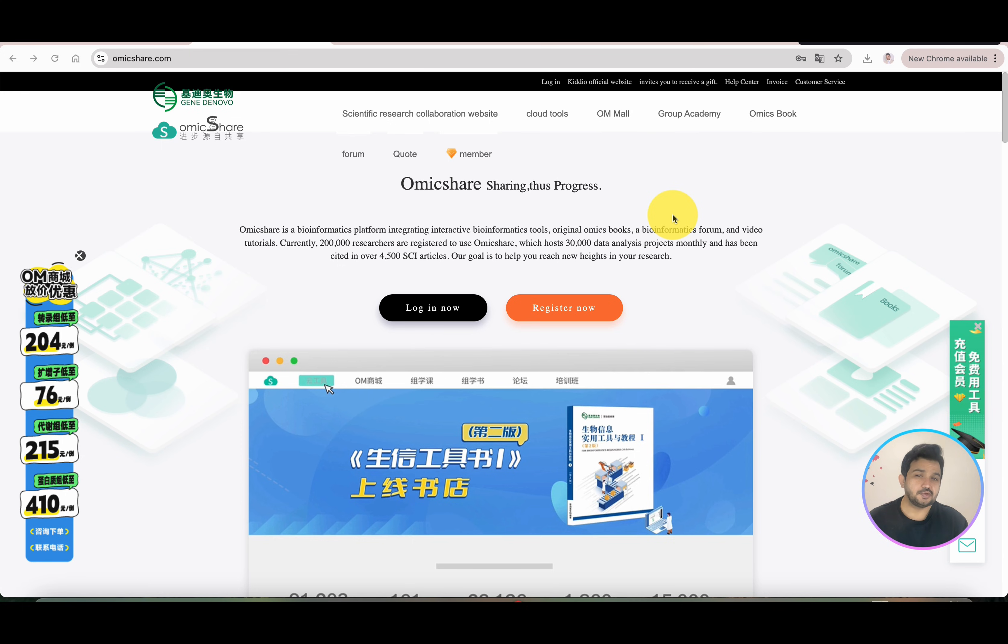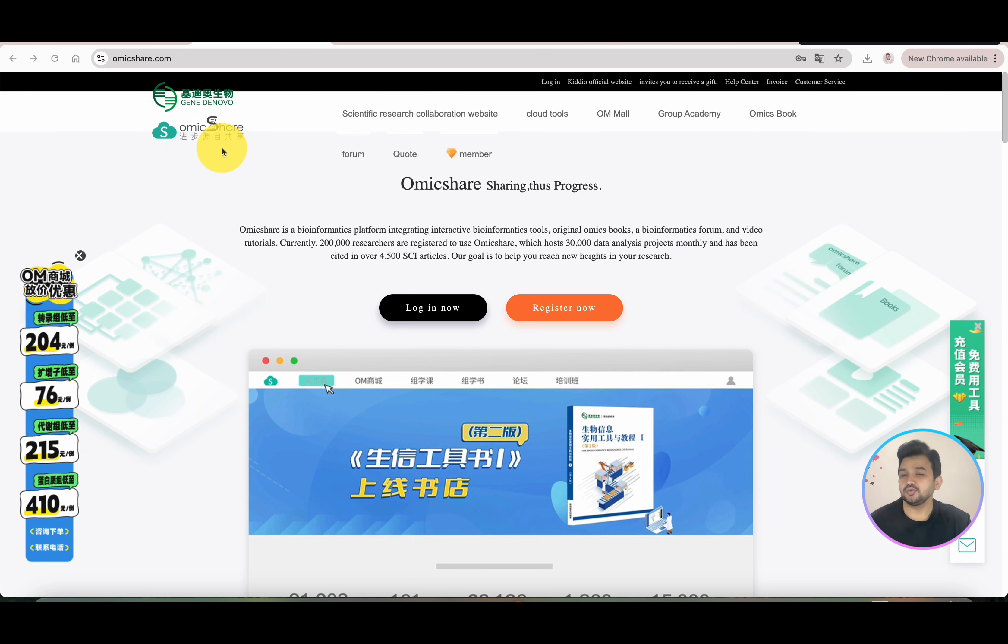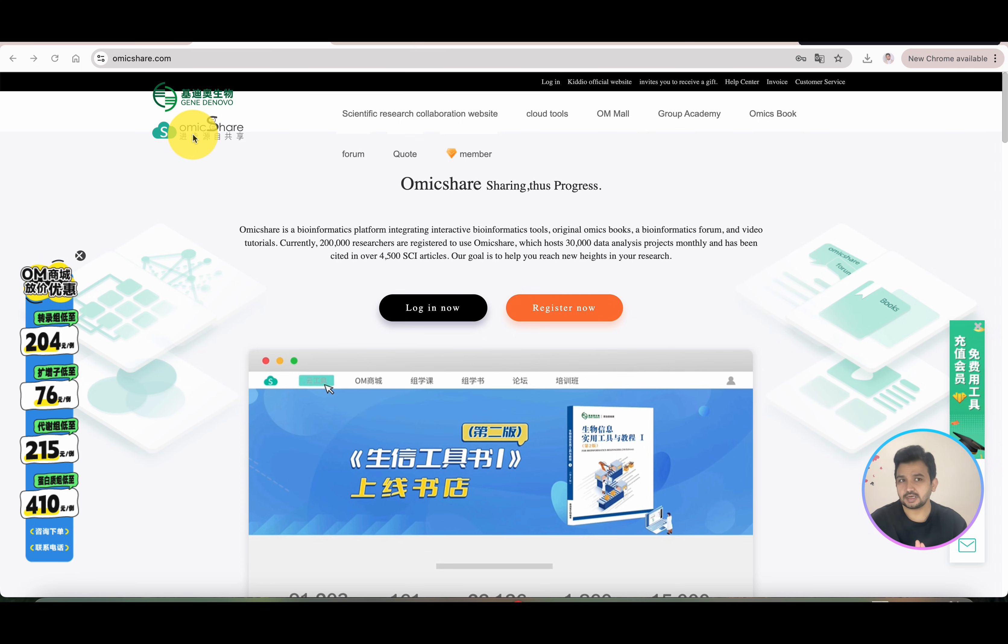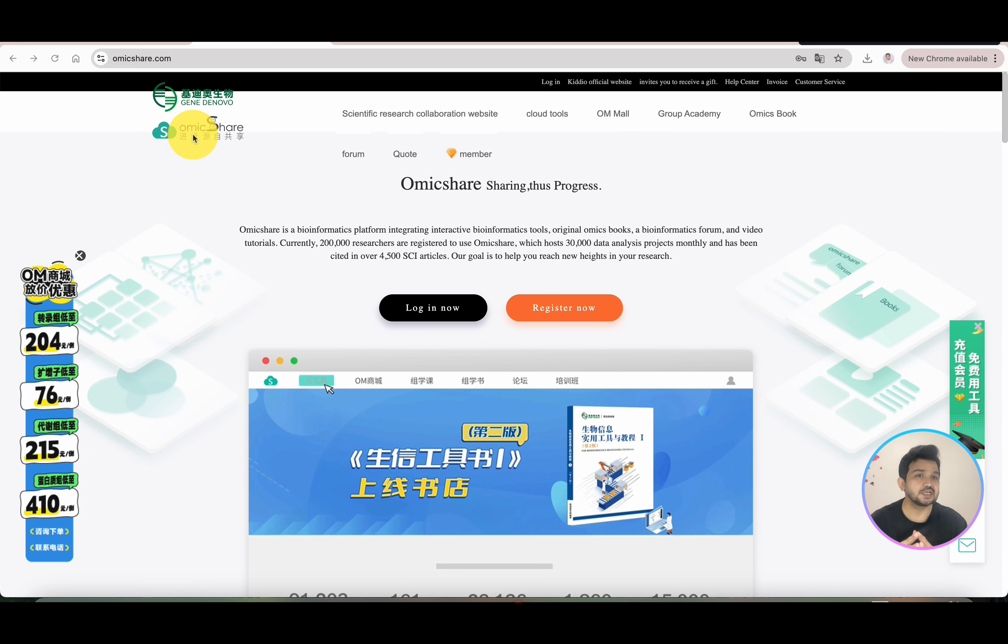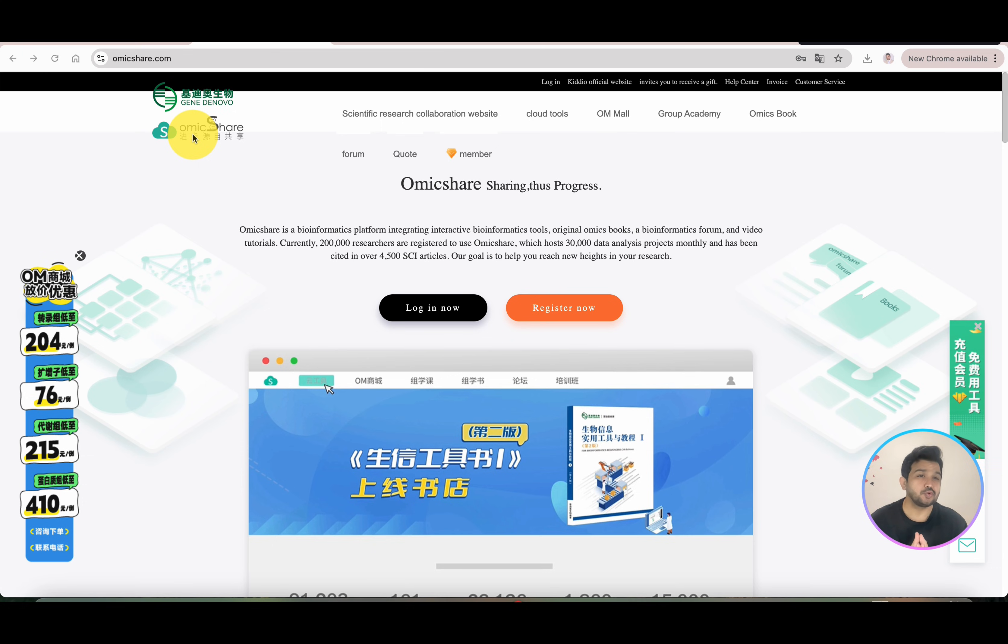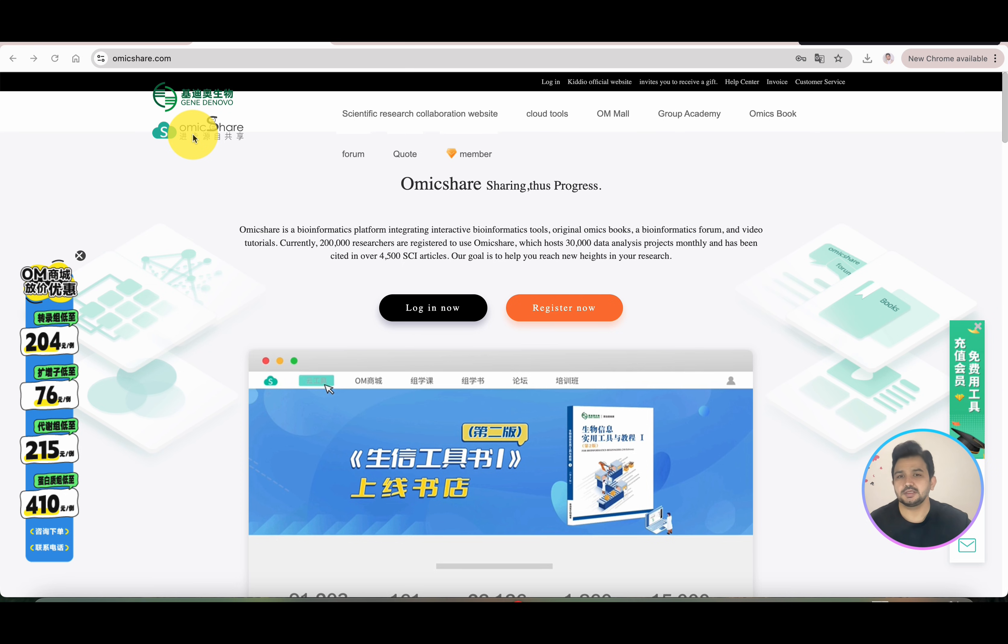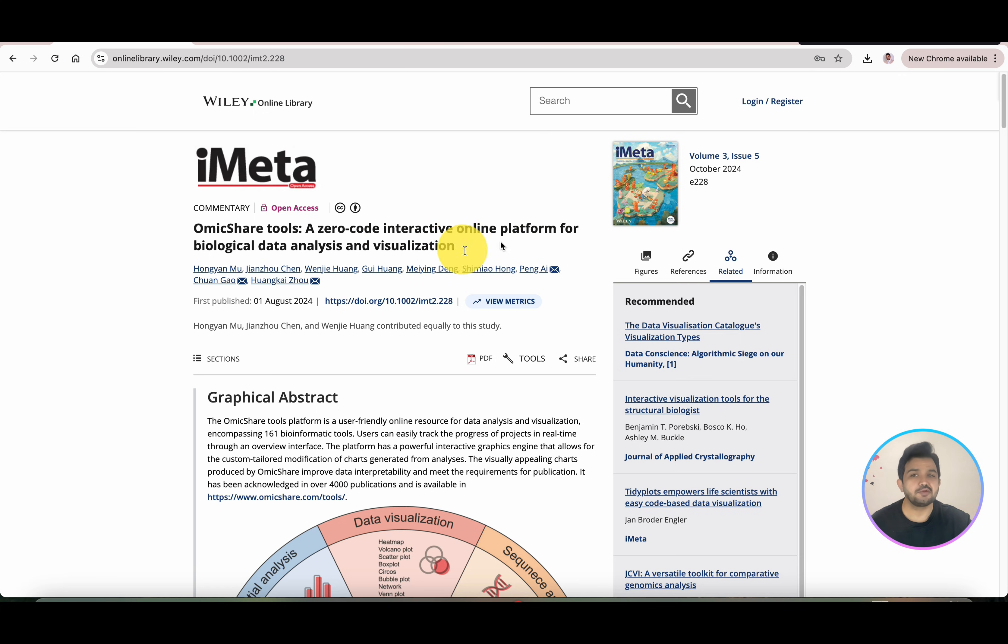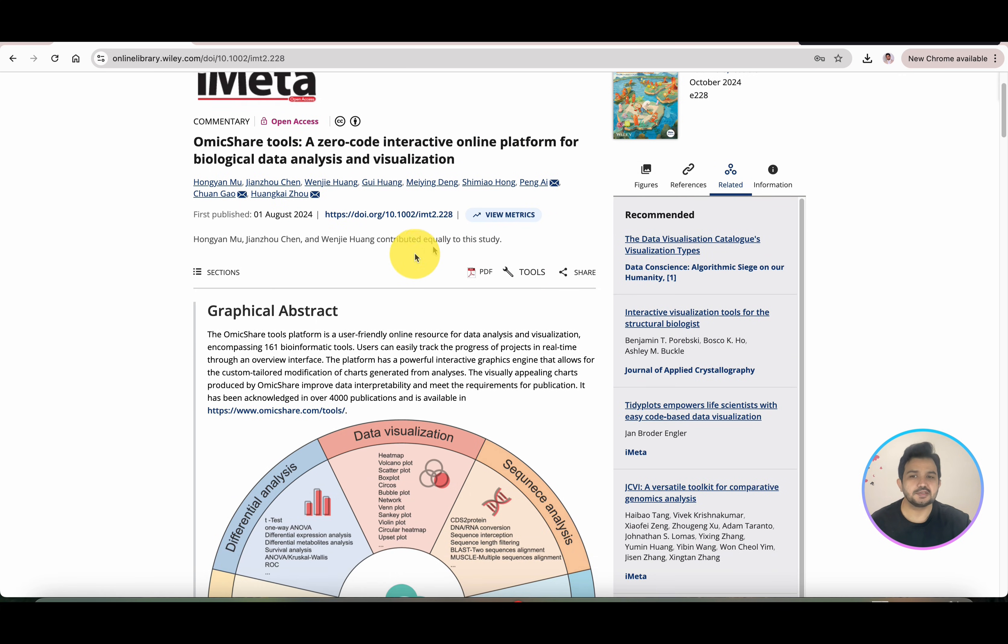Welcome to another video tutorial. In this video, I will show you a new database called OmicsShare. This database also integrates several different bioinformatic tools and software like we have previously explored, such as SRplot, CNS, and many others. OmicsShare is a zero-code interactive online platform for biological data analysis and visualization.